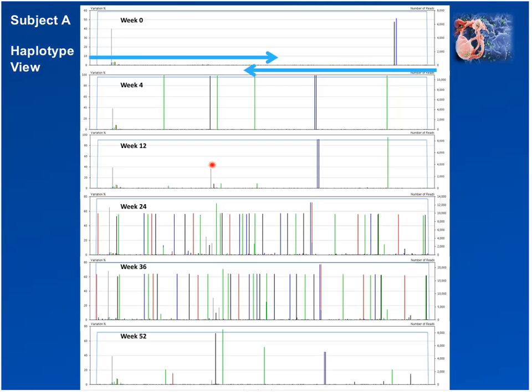The reference sequence here is the consensus of the sequences for the data at baseline or at week 0. So what we want to see in this particular comparison of data is how the virus changes from week 0 over time. And what we're able to do is look at the entire target region and the variance across that target. And as a result, when you see that there are a number of variants showing up at the same variant frequency, that is a viral haplotype.